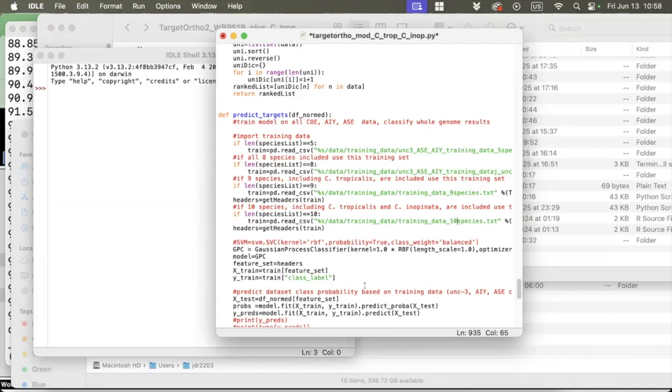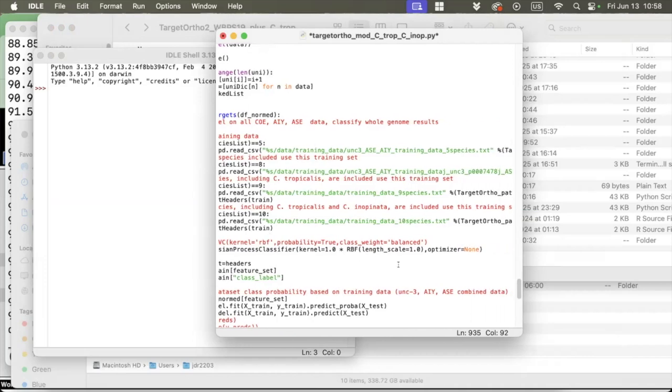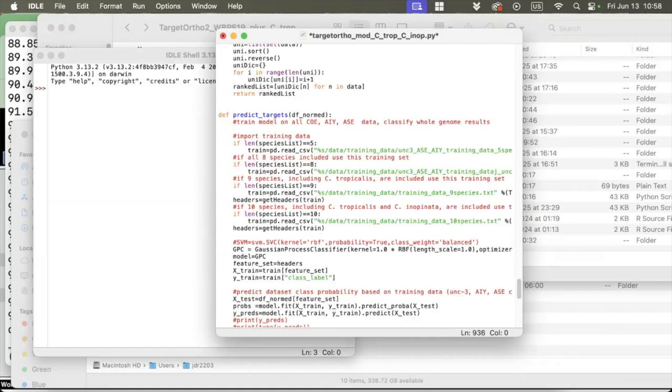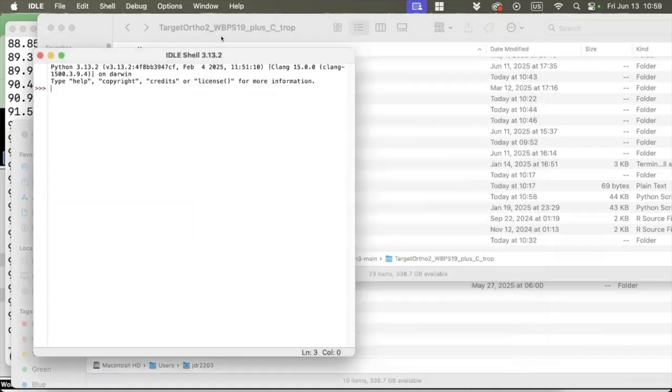Okay. Let's save this. Close the script.